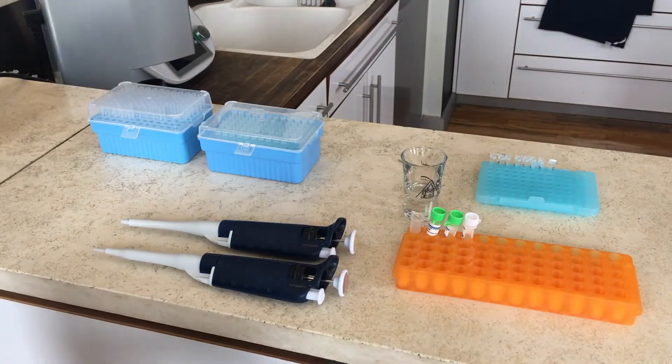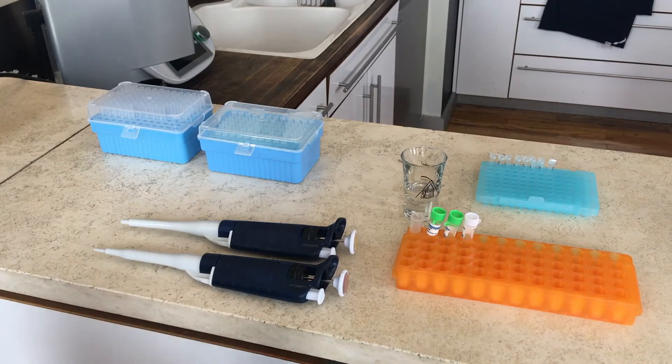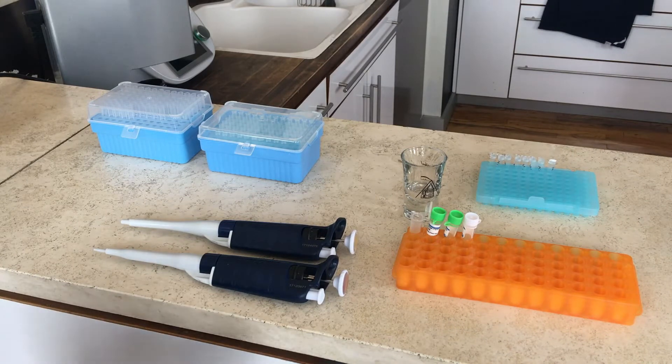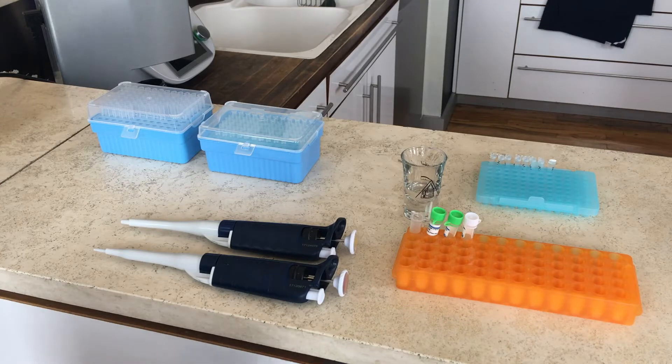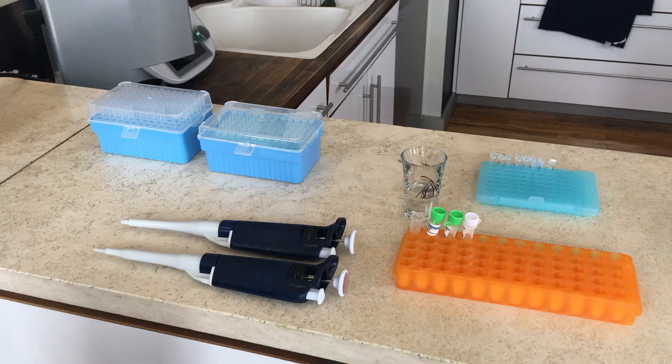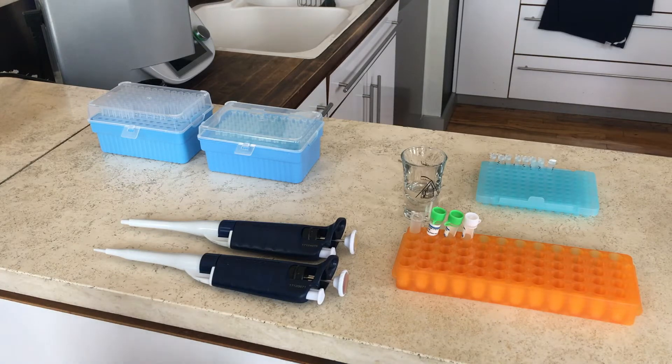That's the end of the extraction process, and we're going to start with the amplification process. The most important step right now is to mix a blend of the fungal primers ITS1 and ITS4, as well as master mix and distilled water, and we're aiming for 27 microliters per sample.